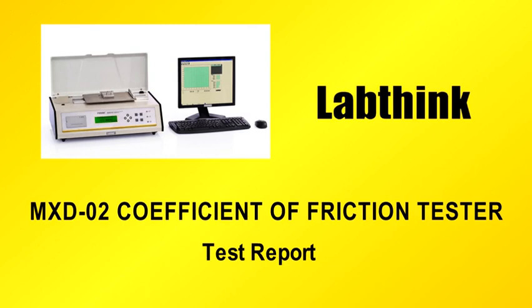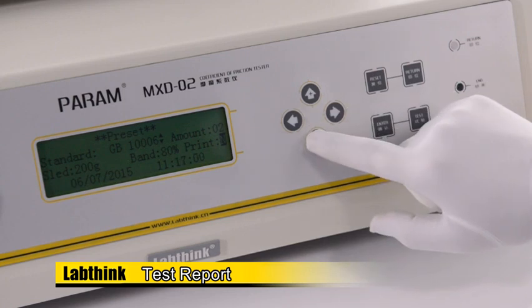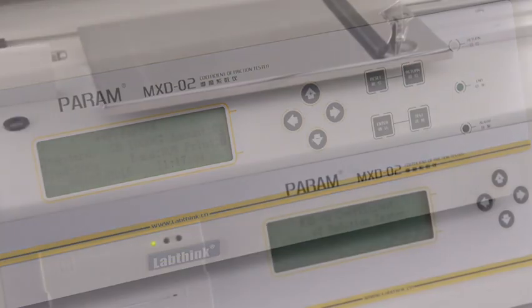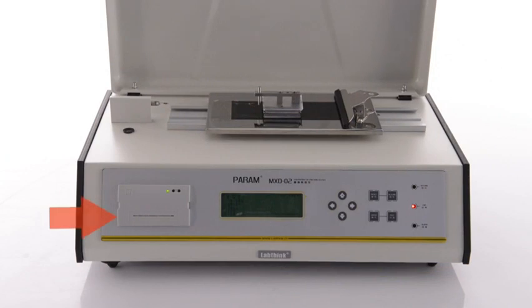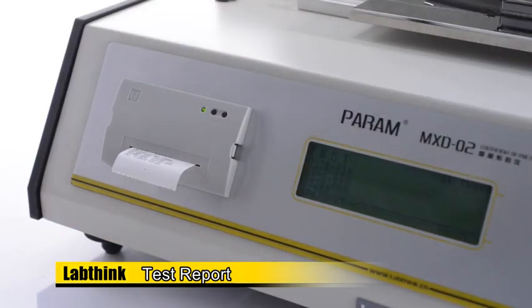Test Report. Select Yes for the Print option in the preset interface and press Enter to save the setting. The indicator light for the microprinter will be turned on. When the preset amount of the test specimens is reached, the microprinter will print the test report by pressing Task K.